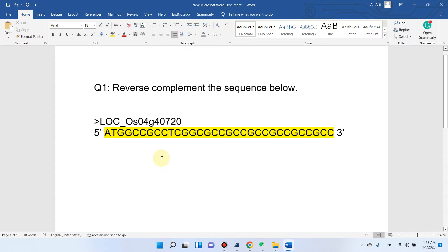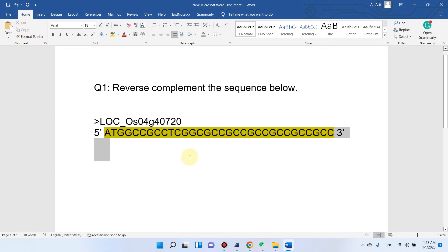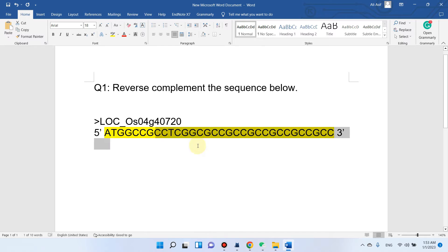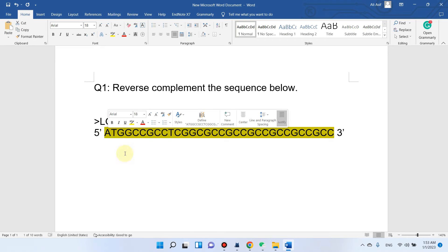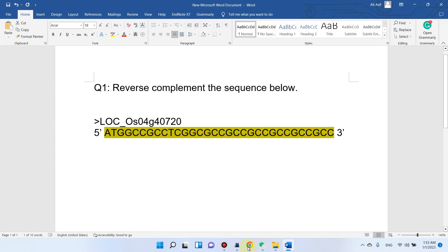Welcome to another video tutorial. In this video I will show you a very easy way to do reverse complementation of any sequence using a web-based tool. What you need to do is copy the sequence which you need to do reverse complementation on. I will simply copy and paste this sequence.